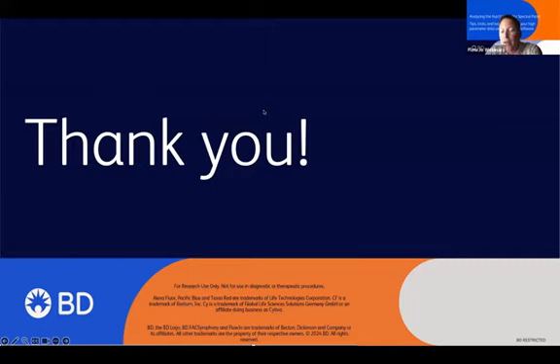That works. But it's also fair game to say, I've run this experiment, and this was the whole experiment, and I finished it, and I haven't even touched embed. Cool, it's done. I've identified two or three populations out of this whole UMAP plot of all the data that I think have some kind of discriminatory power to identify healthy versus diseased or A versus B or whatever it is you're looking to find the difference for.